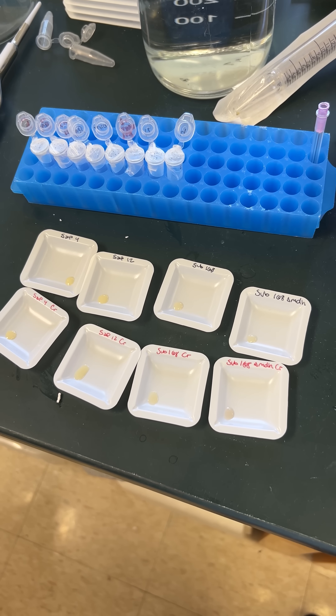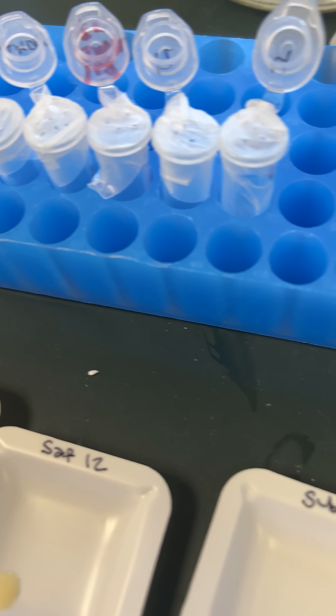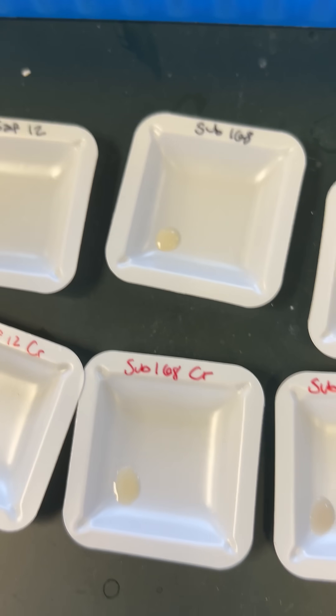War of the methods. We are trying to compare whether if we lyophilize samples it works better for the IR than if we just let the liquid dry.